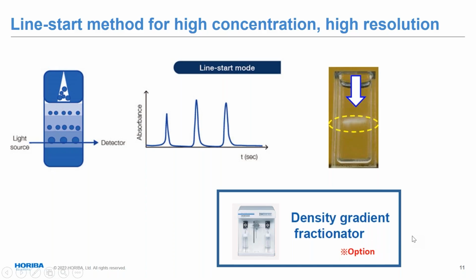information that the computer knows. So it can tell you what the viscosity is all the way down as you're going from the top of the cuvette all the way down to the bottom. And so this is kind of a nice feature. You don't have to sit there and try to make these by hand. It does this for you. It's got some syringes there that allow you to get a nice gradient produced.